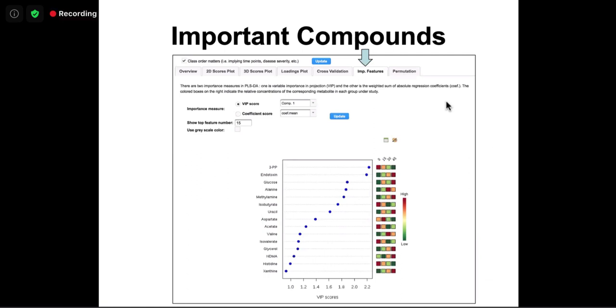So what do these different colors show? Here it shows that you have a feature that's significant, and it's a biomarker for which state. What's the expression level, or what's the abundance? Here it shows that 3PP is most abundant at 0, less abundant at 15, and least abundant at 45. So with more grain in the diet, 3PP is reduced, but endotoxin actually increased. You don't have to open another web page to try to interpret this result. It's significant, but how does it work with regard to my phenotypes? Here it directly plots the phenotype abundance level right beside this one, to help you interpret it.